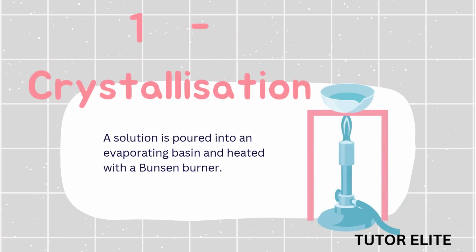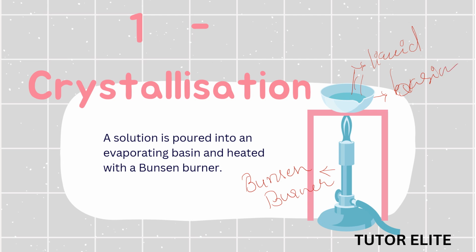A solution is poured into an evaporating basin and heated with a Bunsen burner. This is the Bunsen burner, and this is your evaporating basin with the liquid in it.